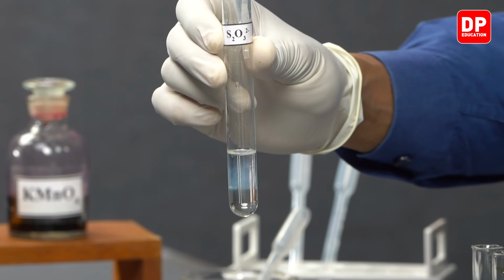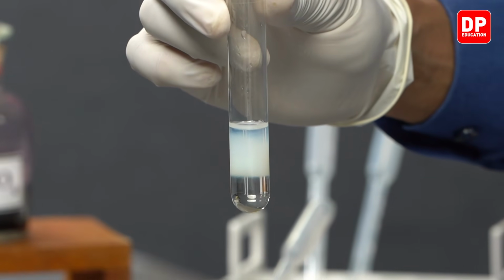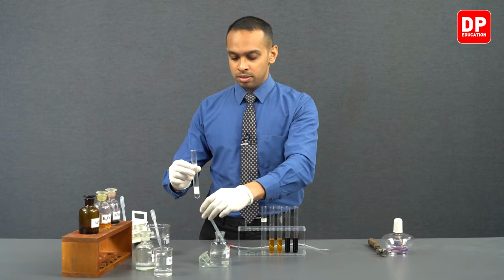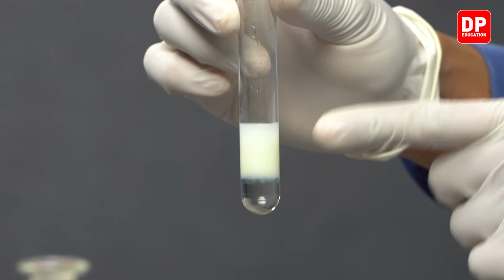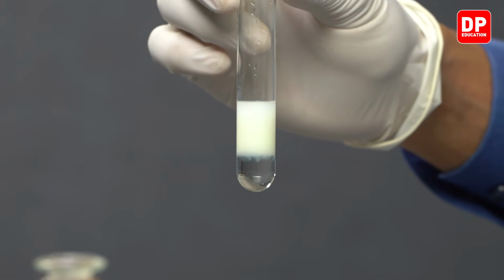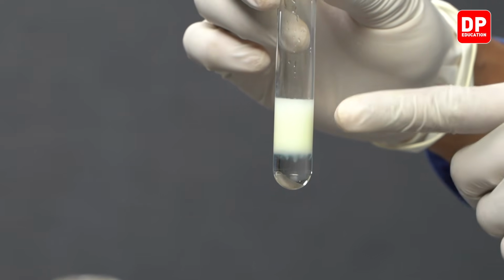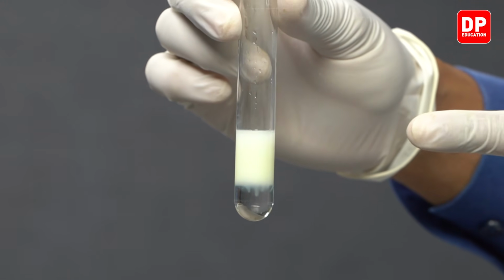We can see as soon as we add it, we can see the formation of a white color solid here. So when we add HCl to a thiosulfate ion solution, we can see the solution is starting to become milky.